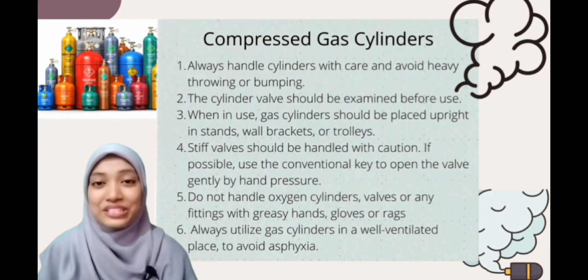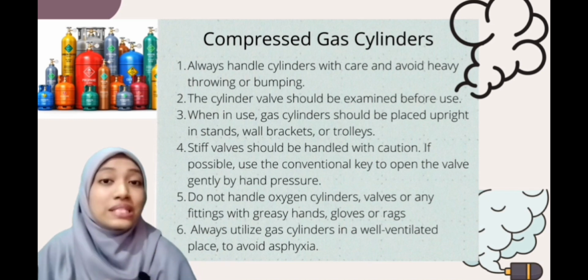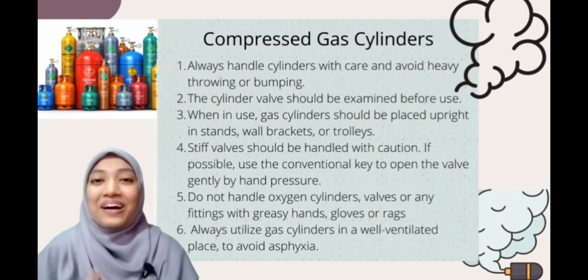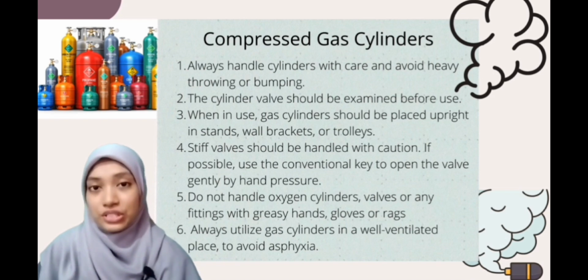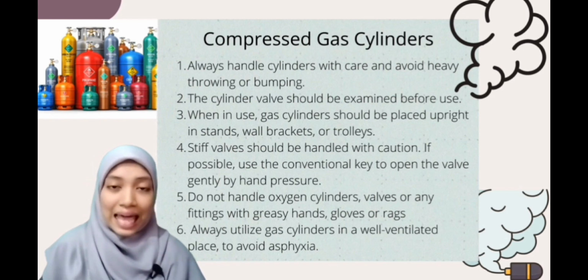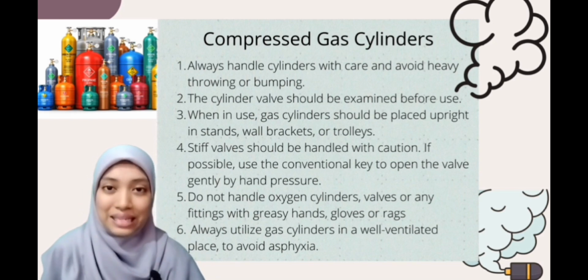Other than the equipment shown in the video, there are also several pieces of equipment that require specific techniques or steps to use so that no danger occurs. Okay, first is compressed gas cylinders. Compressed gases may be dangerous since each cylinder contains a huge amount of energy and may be very flammable and poisonous. So, as a result, we must understand how to use it properly.